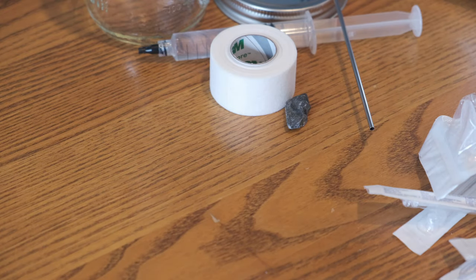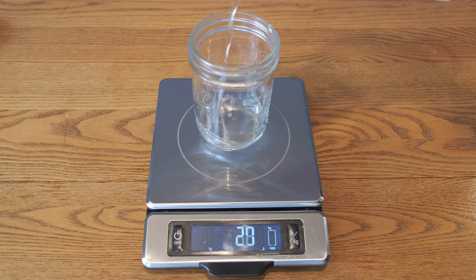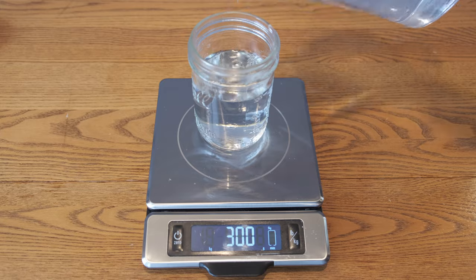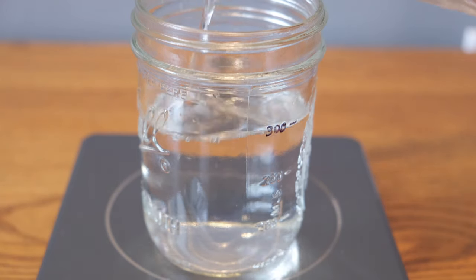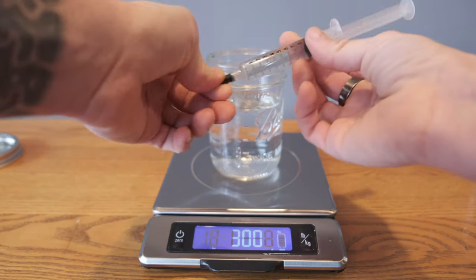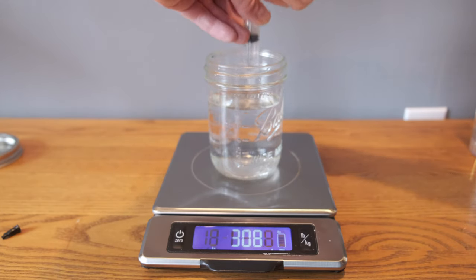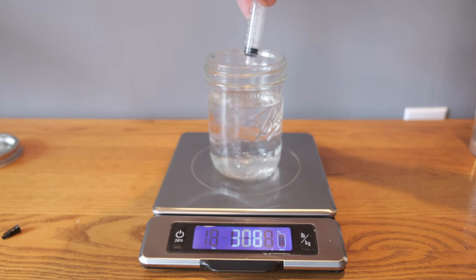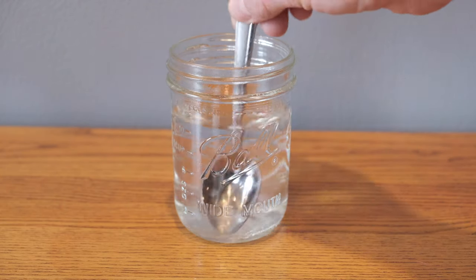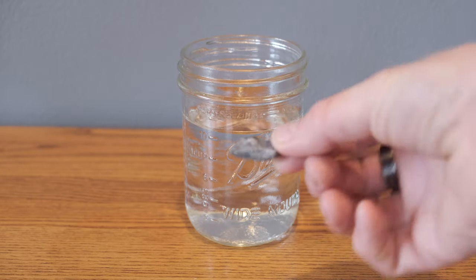The surprise ingredient here is a rock. I start by filling the jar with 300 grams of water, and that's equivalent to 300 milliliters. I love that metric system — if you don't have a scale you can just fill it up to the 300ml mark. Then I add my 12 grams of nutrients and fill and empty the syringe a couple times just to wash all the goodies out. Give it a little mix, then add my special rock — this is going to help break up mycelium later.